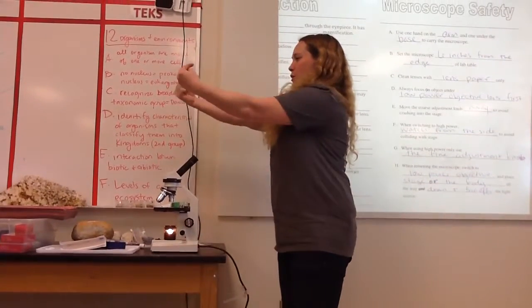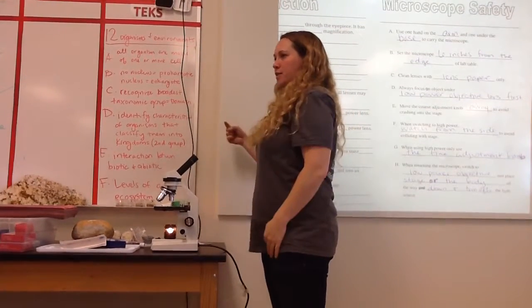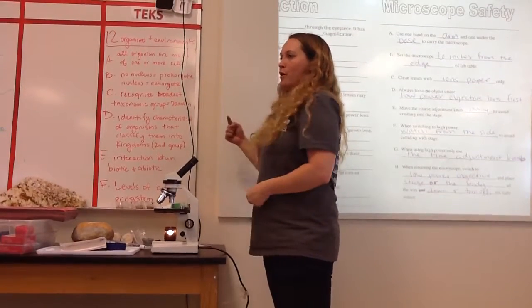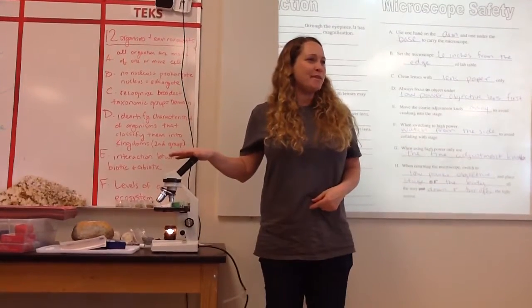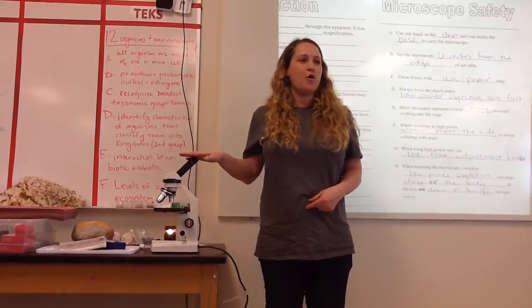When you want things to go this way, you have to push them that way. When you want things to go right, you have to push them left. If you want things to go left, you have to push them right. Who knows why that happens? It has to do with some kind of optical thing, something you would already know about.